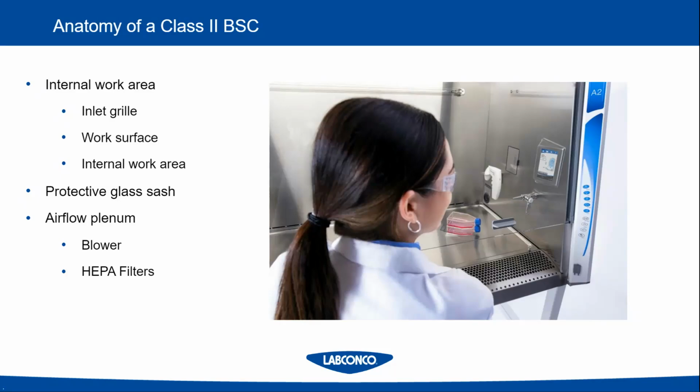The glass sash is a really important safety device. Unlike a fume hood, where the lower the sash is, the safer the fume hood operates, in a biosafety cabinet, the sash needs to be used at a very set specific height.